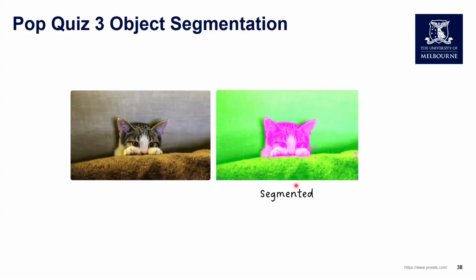Because I've covered all the object segmentation parts, let's also check our understanding of these sections. The question was, in conventional segmentation, what is the best way to set a threshold on data sets with various background levels? Most people selected the correct answer, applying the same auto threshold algorithm.